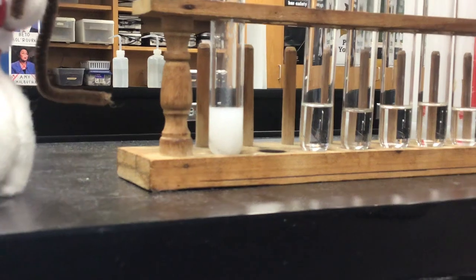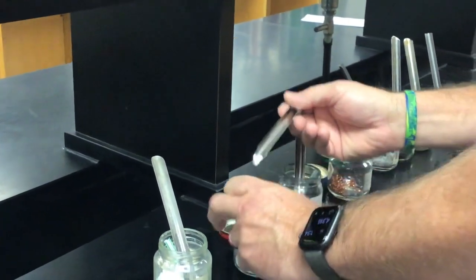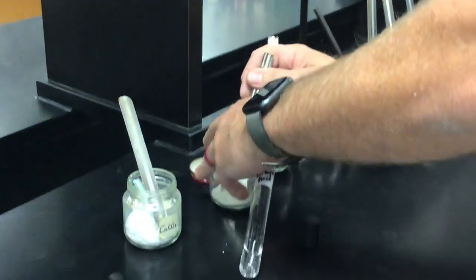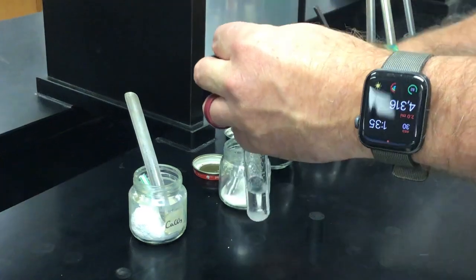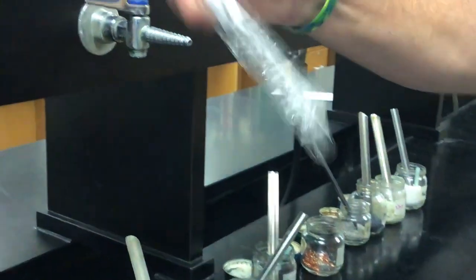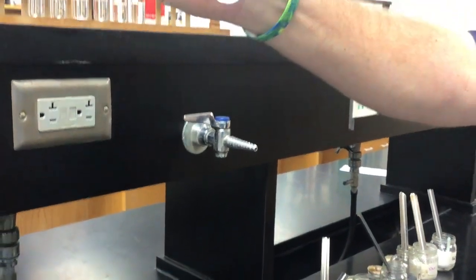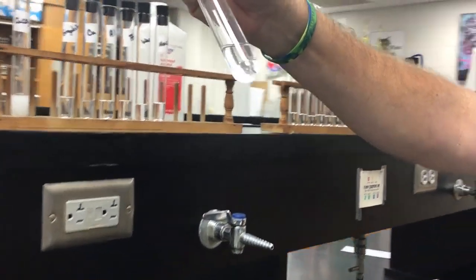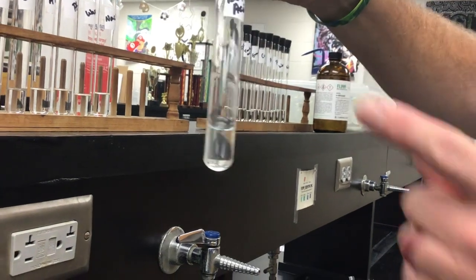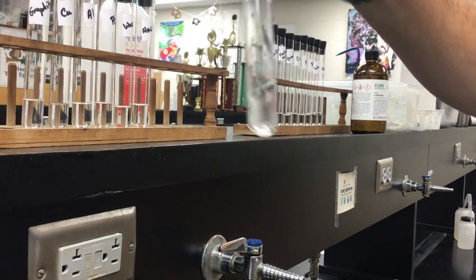Going to do the same with the tartaric acid. So I'll come back to the tartaric acid. Put a little bit of tartaric acid in there. A little bit more tartaric acid in there. I can get my scoop to work. Drop that tartaric acid in the isopropyl. Shake it up a little bit. We'll see if that is dissolving in there. Tell you what, it's pretty obvious with the water before, but I'll go through all of these and then at the end we'll go back and look at them afterwards. So let that sit for a little bit and see what it does.